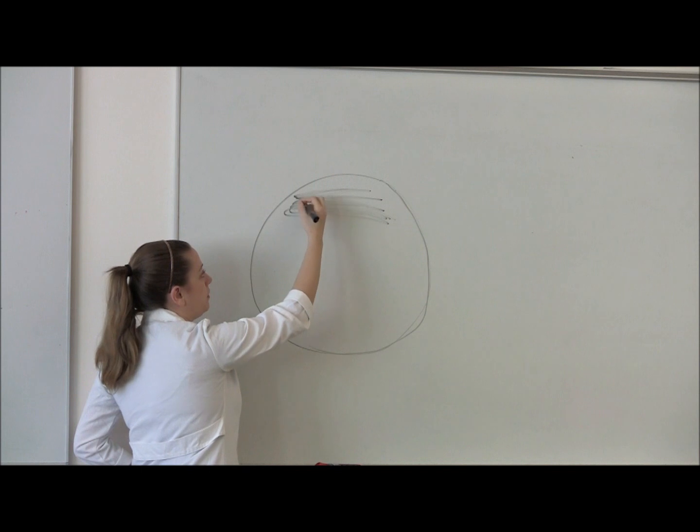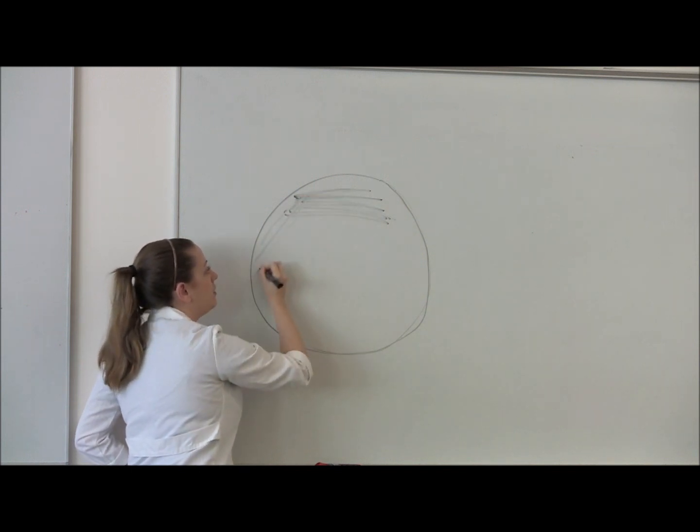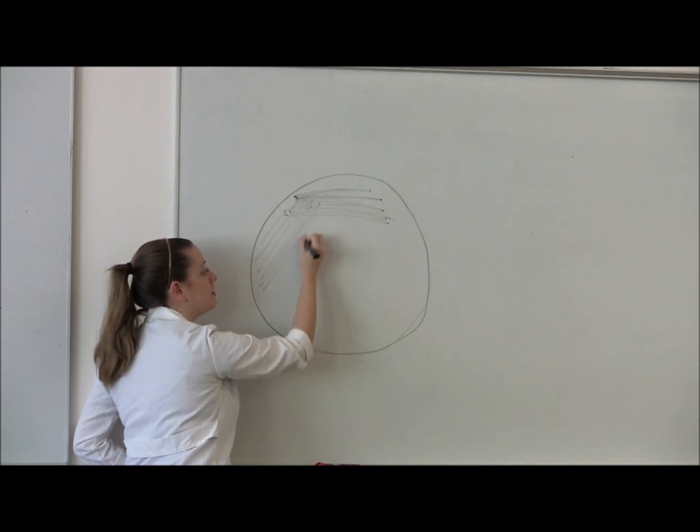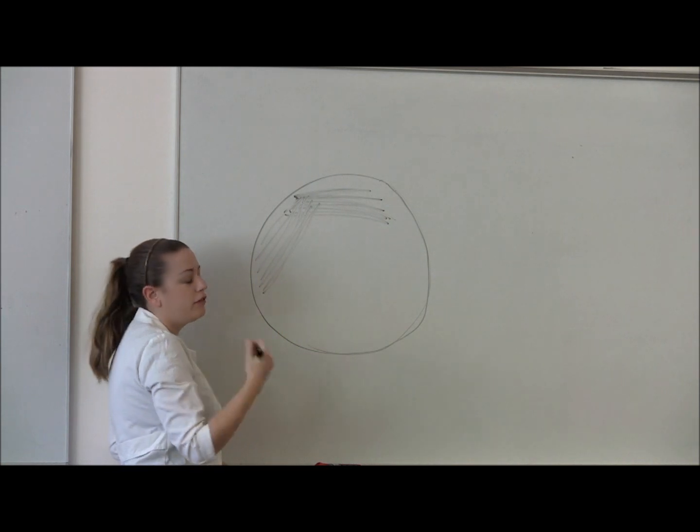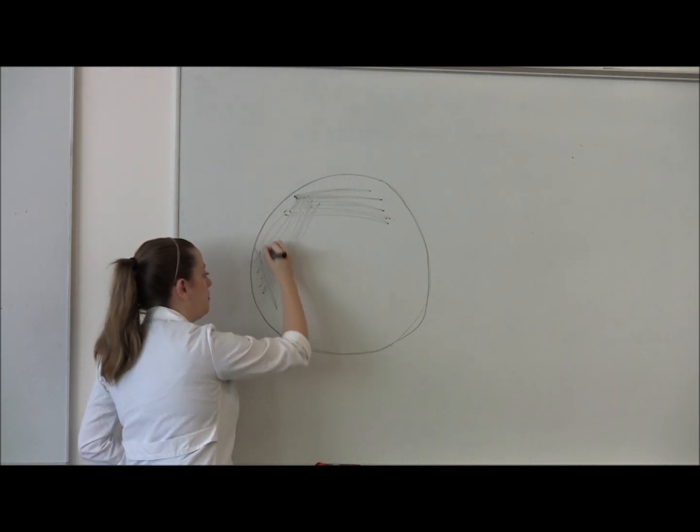After your loop has cooled, you're going to take your loop, go back into the first quadrant, and take bacteria and spread it out into your second quadrant. You'll flame your loop once again, let it cool, and then do the same thing into the third quadrant.